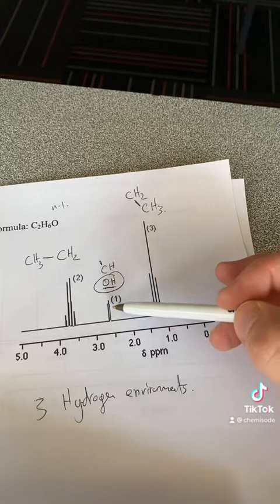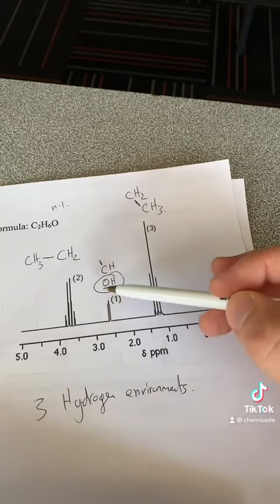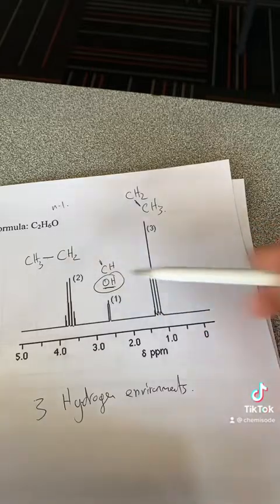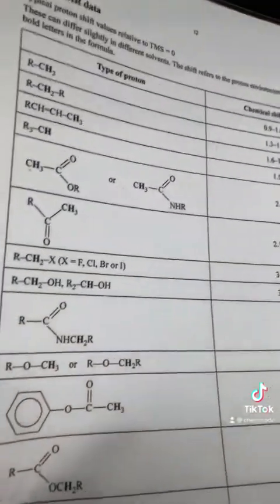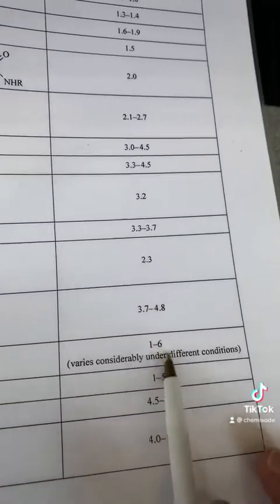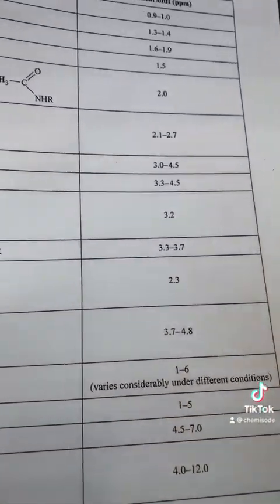This one here has 1 hydrogen, and because I think it's an OH, I reckon it's going to be anywhere within this section here. I can see the OH here, which is, where is it here? That is anywhere between 1 and 6, so that's not going to give me much information at all.